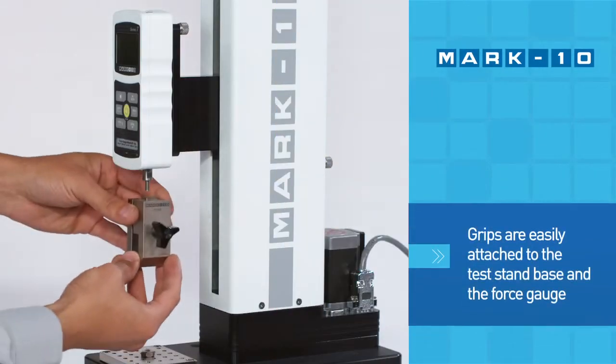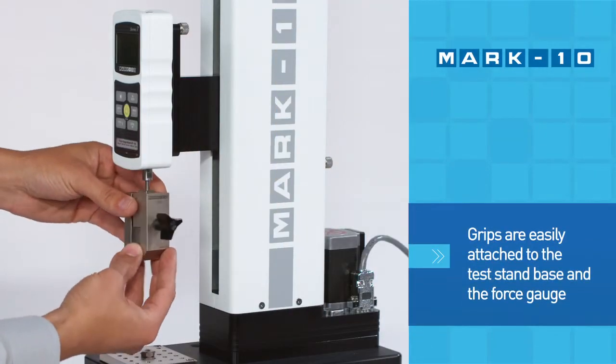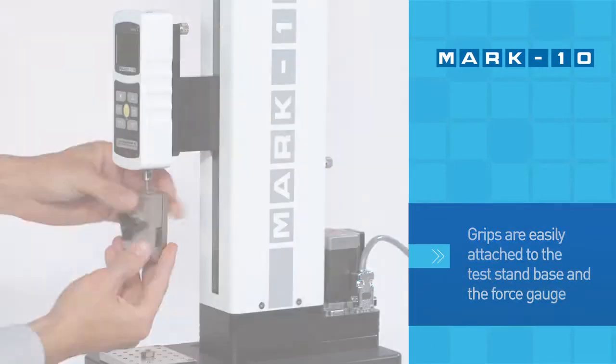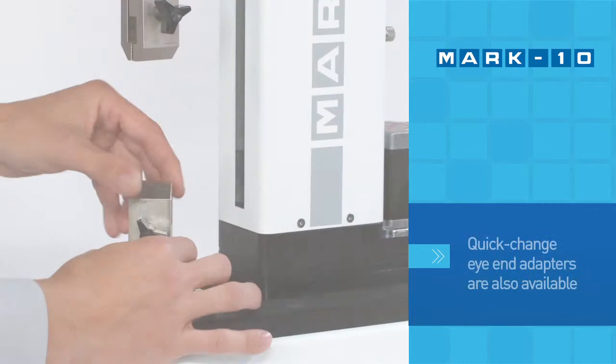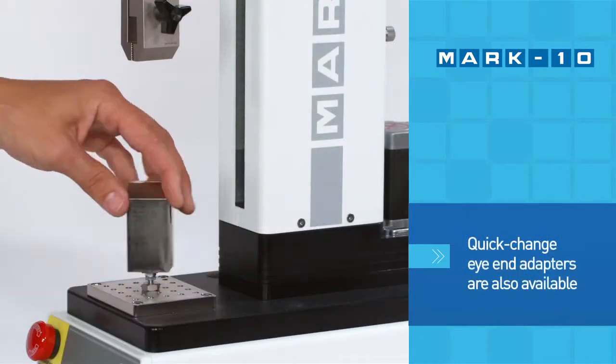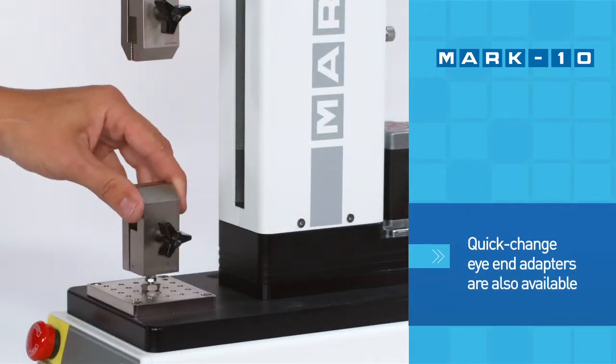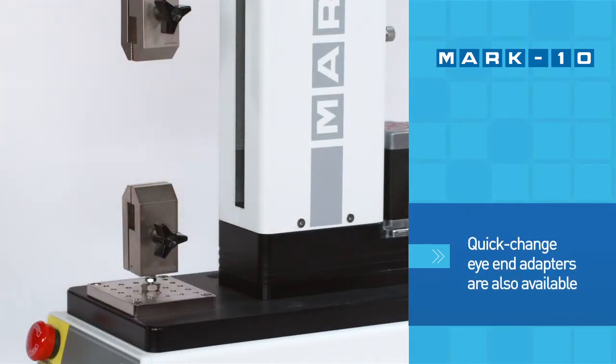Grips can be fastened onto the test stand base and force gauge. Quick change eye end adapters are also available to accommodate certain grips and fixtures.